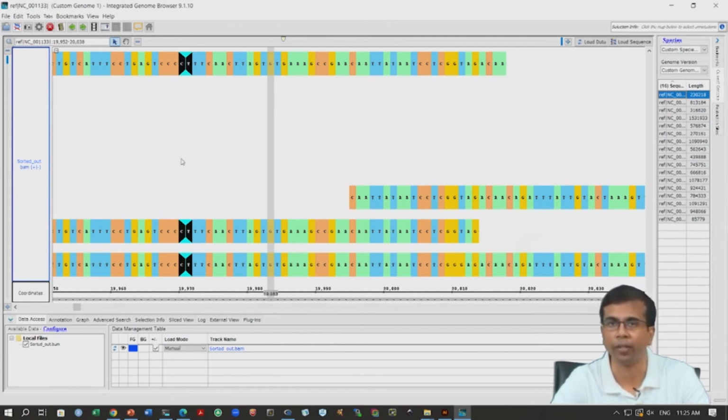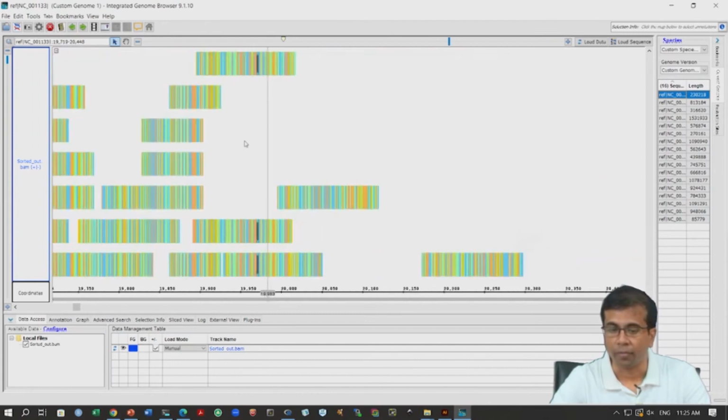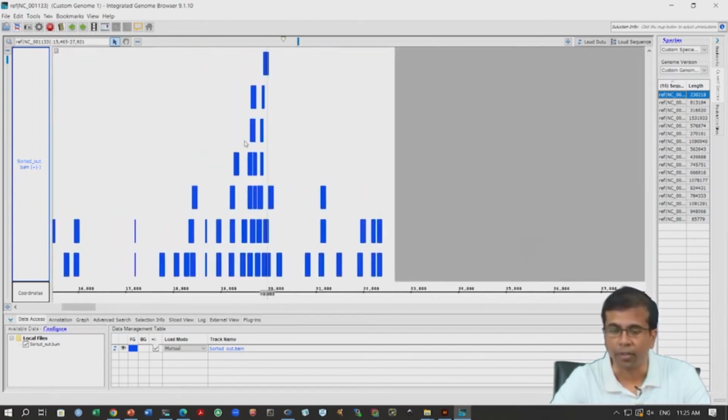We will not try to do that, because it will take a lot of time, as the VCF file can be big. One thing I will show you: we can zoom out a bit and see the read mapping for these positions, and we can load the full mapping that I have already done. I can show you how this full mapping would look. It will look much more complete along these positions. So, let us load that.